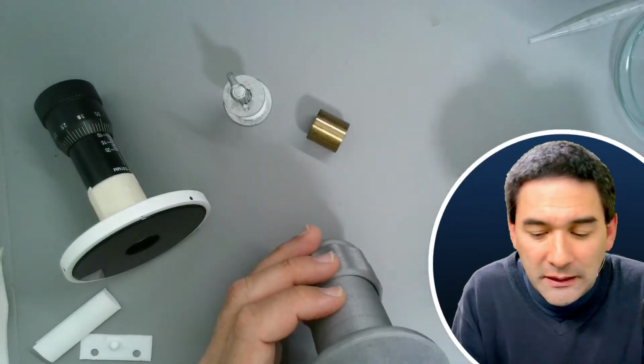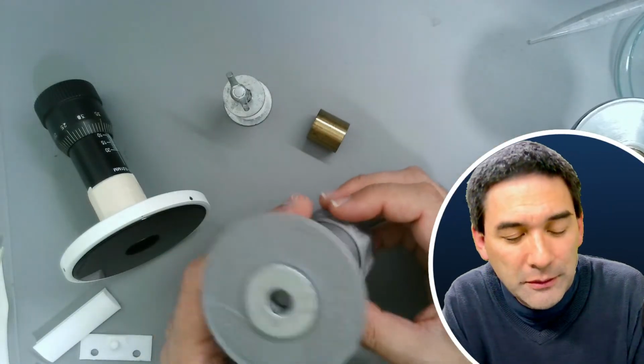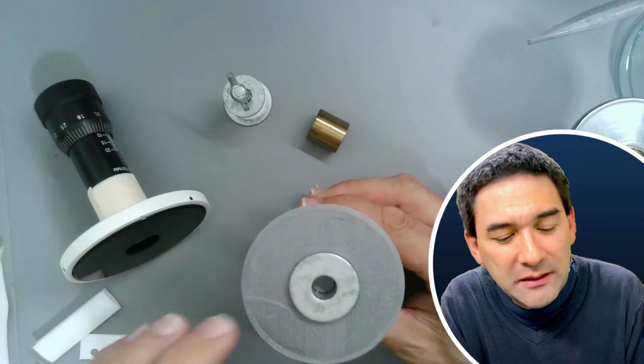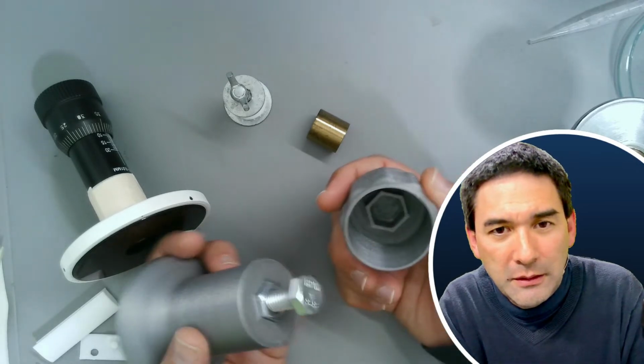So, but let's go on a little bit here. This here is a 3D printed one. I downloaded the files, and I've got a 3D printer. And you can see here that the platform should be a large washer or glass plate, and I didn't have that, so I put a small one here. And simply it looks like this here.